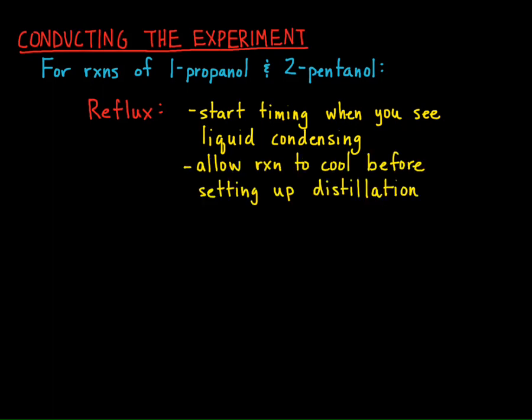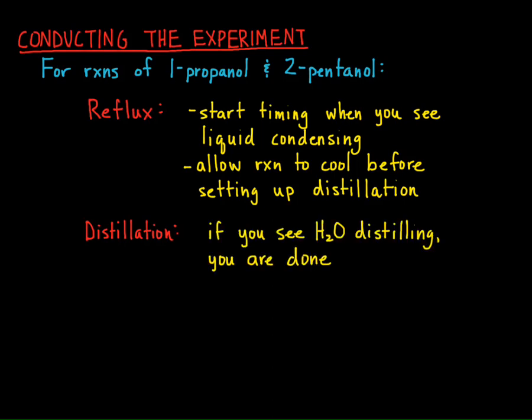At the end, it is imperative that you cool the reaction mixture to minimize hydrogen bromide vapors. After the reaction has cooled, you are then going to set up a simple distillation. You know the distillation is complete when you see water coming over. And the last part of the procedure involves a separation and washing of your organic layer.